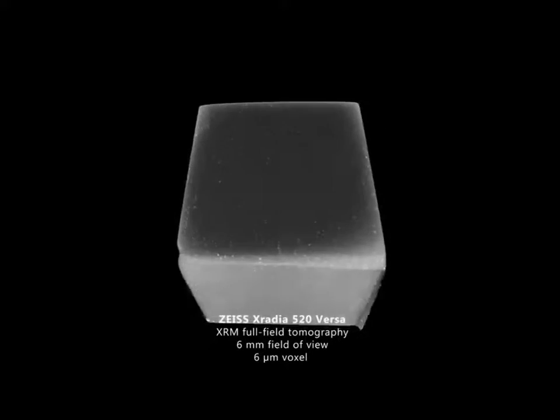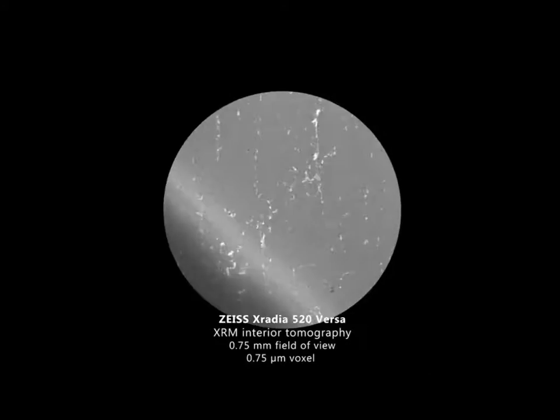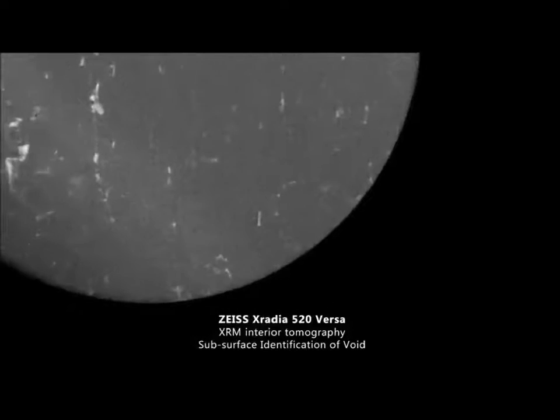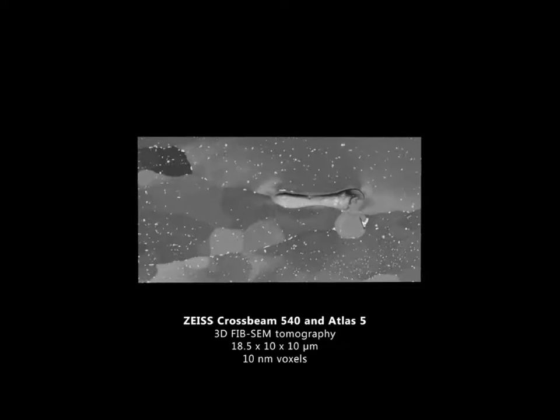It's about 6 millimeters in size. Take 6 micron voxel acquired on the Versa. We can non-destructively zoom in, get down to a micron or below voxel dimension, get quantification of those inclusions and volume percent and things like that. But you can now plan an imaging experiment and a targeted experiment to pick out individually possibly sparsely located inclusions and dig to that region of interest with already knowing, effectively having this roadmap of the X-ray microscopy data.